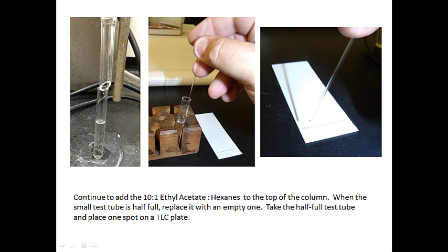What we're going to do is, we don't know when the compounds come off the column because they're colorless, and so it's not like the spinach experiment where we could see the yellow and green pigments coming off the column to collect them.